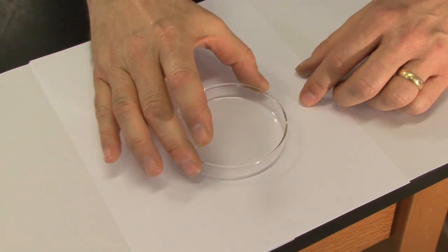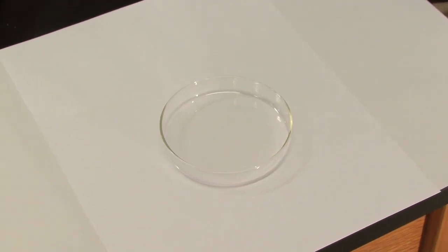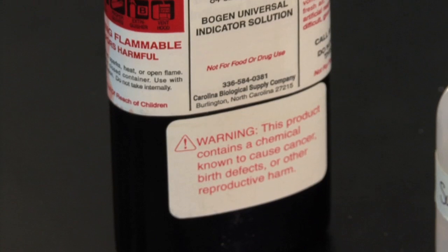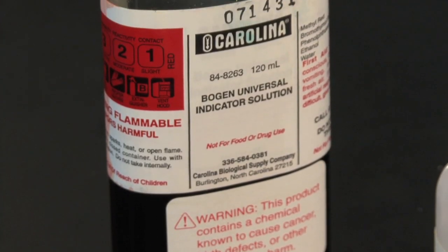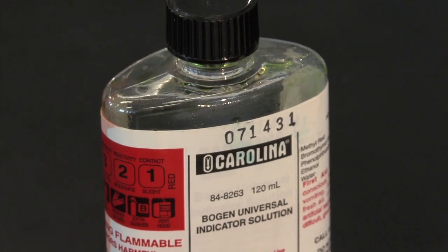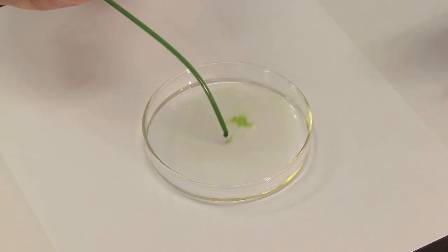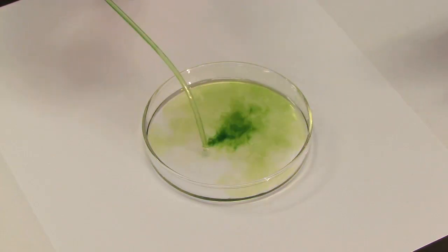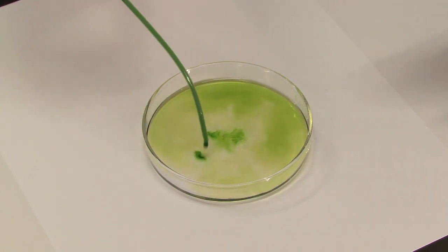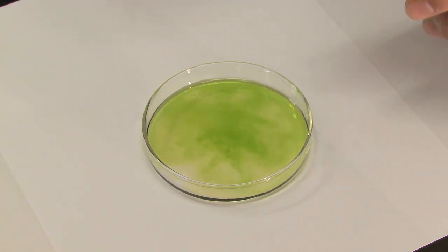Okay, we have our glass petri dish here and I'm going to start by just adding a little bit of water. Then add a few drops of universal indicator. This is a good time to also talk about the safety precautions, because really the only safety precautions we have to worry about here are with the universal indicator. Universal indicator is an alcohol solution — you can see as I'm adding it, some of the ethyl alcohol is evaporating.